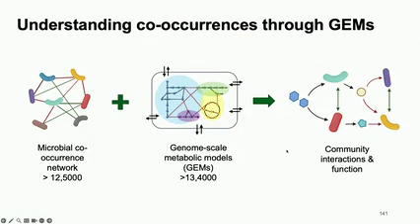And this we can formally test and predict on a large scale. From this large number of association or correlation networks plus GEM, we can see they co-appear most likely because they compete or complement the same type of compounds. So in this case, we use metabolites as a mediator, a communication between the two microbes, which we believe, theoretically, is how they usually interact.